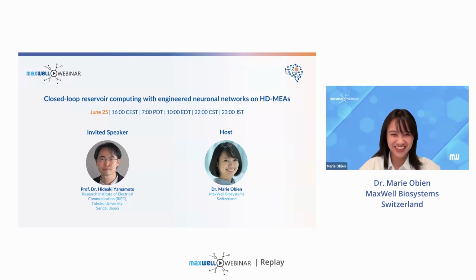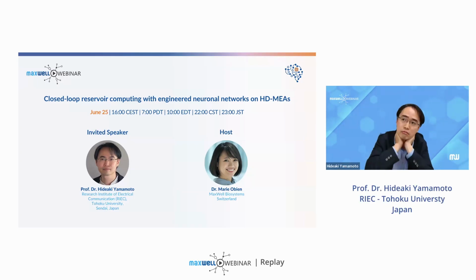This is a curious question. Well, you can do it pharmacologically if you block excitatory neurotransmission. Let's say not fully, but partially, it could reduce the synchronized bursting, for instance. I think you could plate the cells with lower density, and it would reduce the connectivity between the neurons.